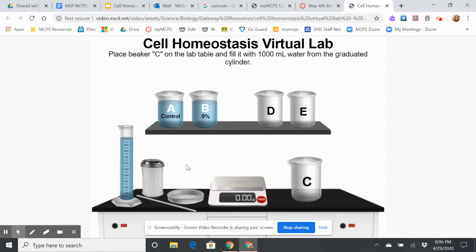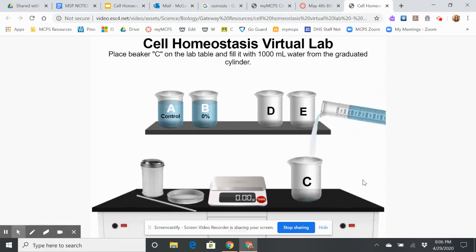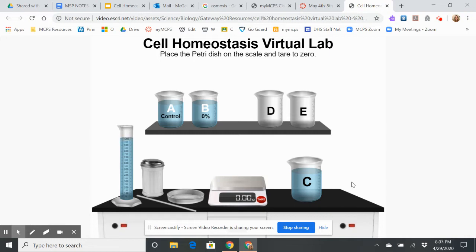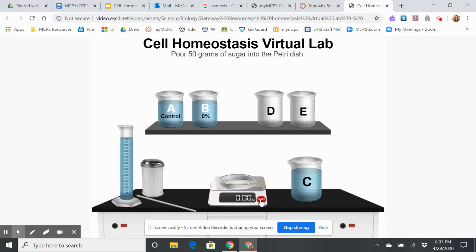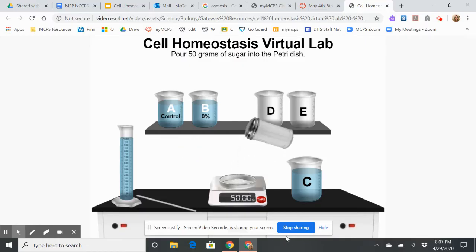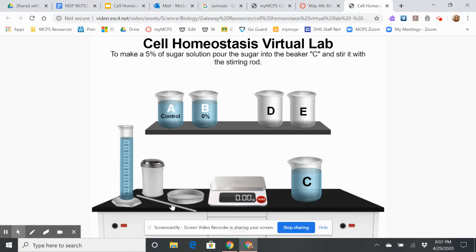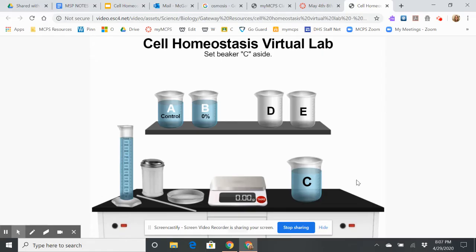Now I've got beaker C. I'm going to add the same amount of water, because that will be constant. Then I'm going to weigh out a certain amount of sugar. When you use the balance, you have to tare it — that means to make it zero. Now I'm going to add 50 grams of sugar, pour it in, and stir it. I'm making a solution that's a 5% sugar solution, meaning 5% of the molecules are sugar and the other 95% are water molecules.